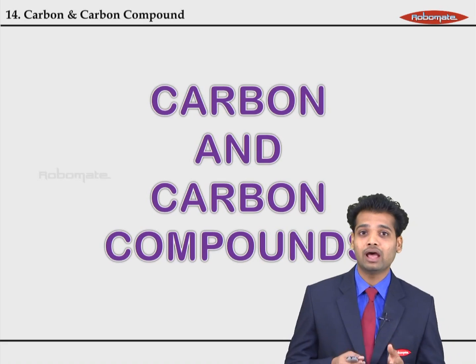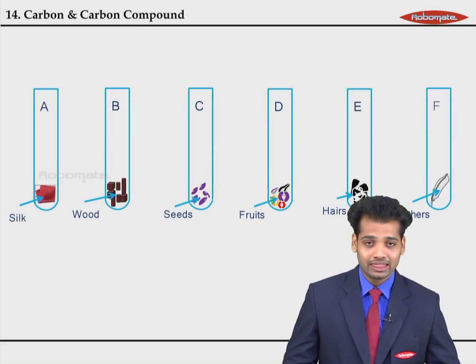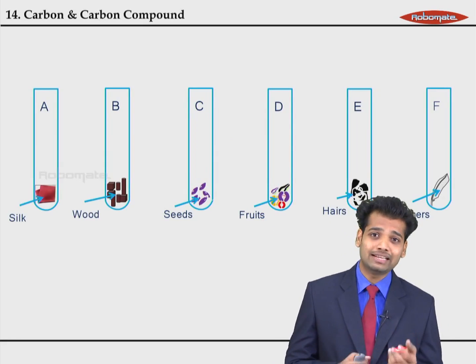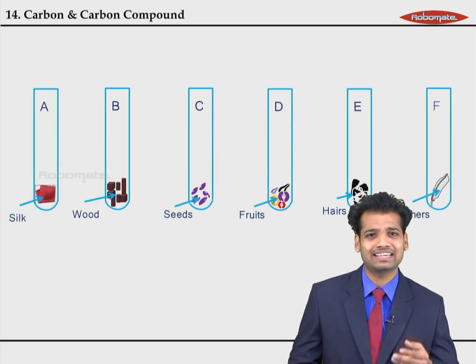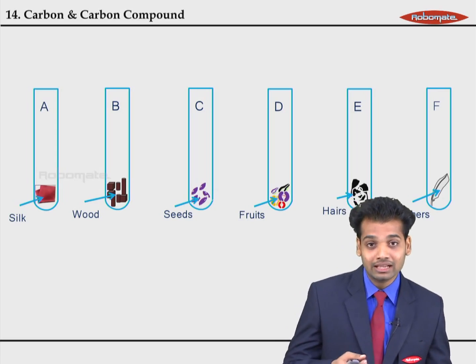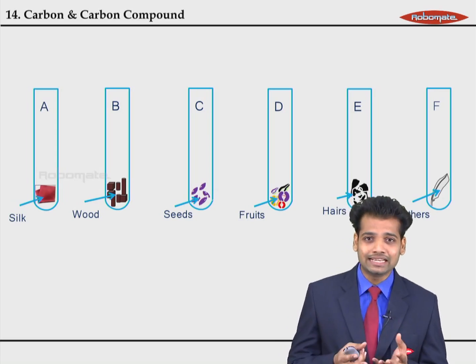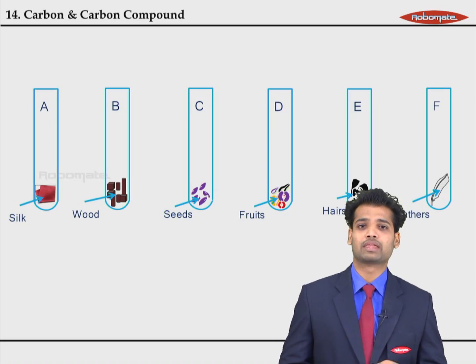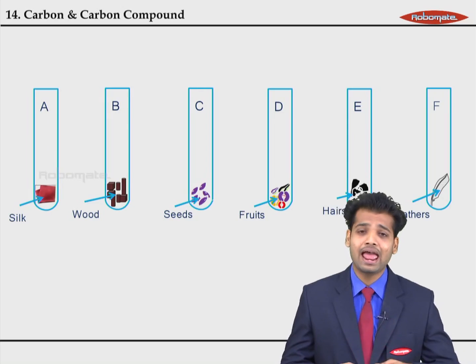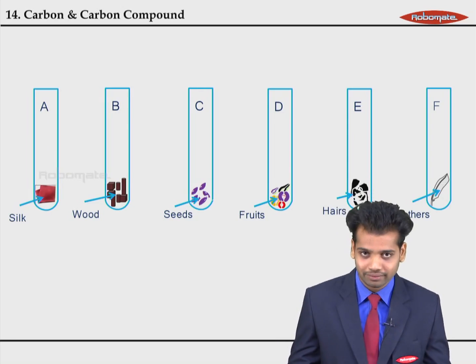I'm going to burn things up. Now, I'm not going to burn very rare things. I'm going to burn things which you find out in your surroundings every day. Like for example, I've taken some silk, some wooden article, some seeds of any fruit, some hairs, your hair, anybody's hair, and a feather of any bird.